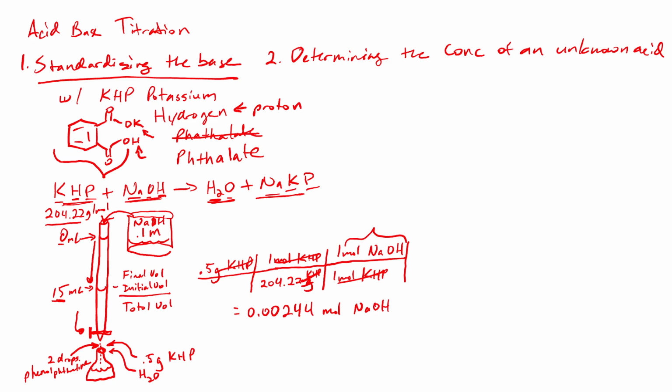That's great. You know why? Because I have a volume of sodium hydroxide now. And recall that concentration or molarity, so don't get confused. The most common unit for concentration is molarity. People will say concentration is C or C₀, and they'll use it interchangeably with M for molarity or molar. The equation is this: molarity, or concentration, equals the number of moles divided by the volume in liters.